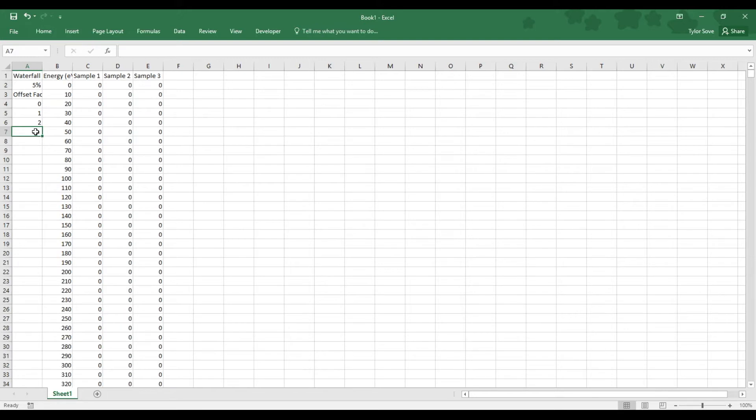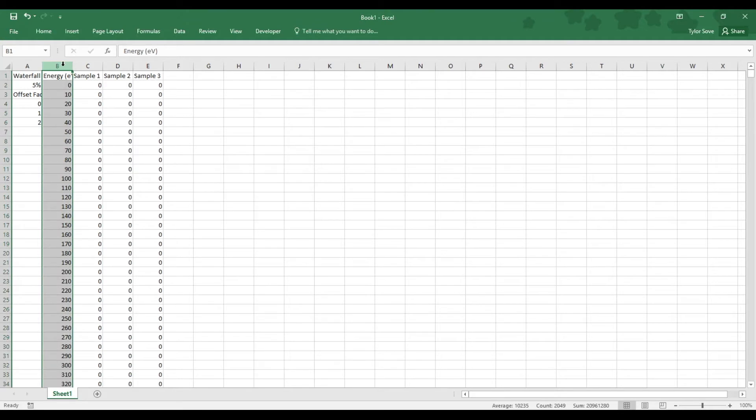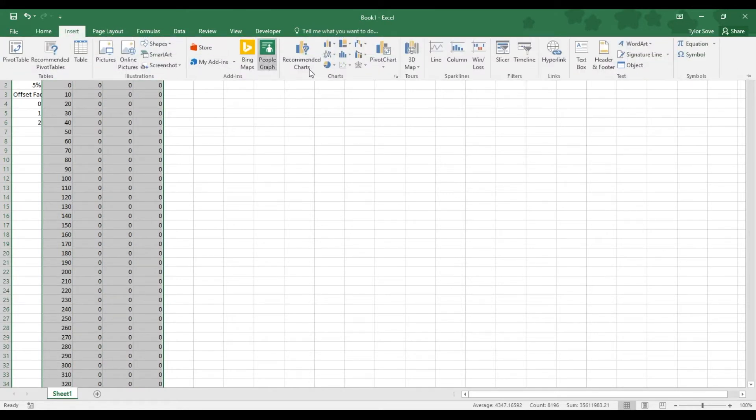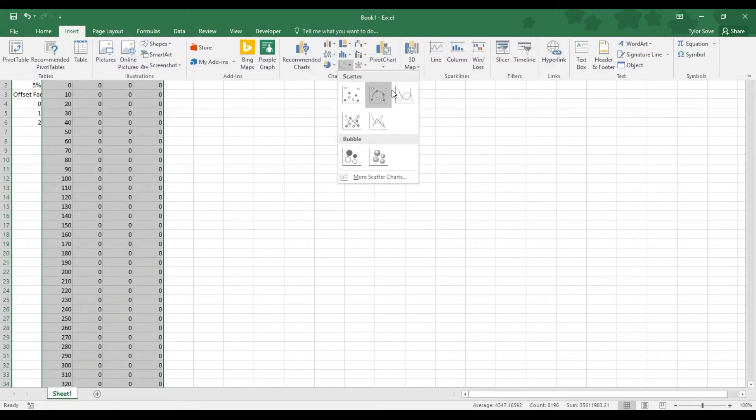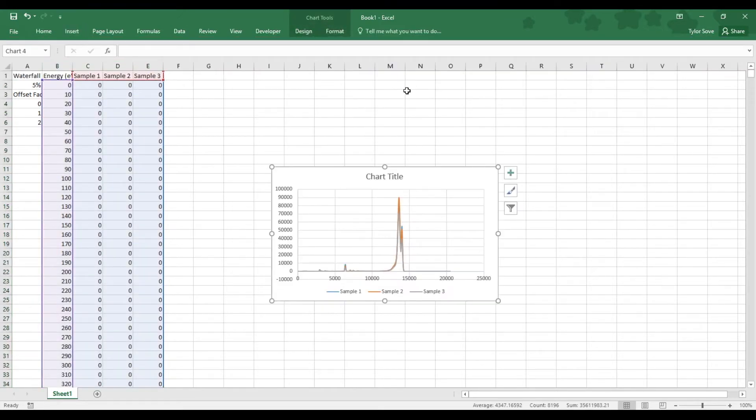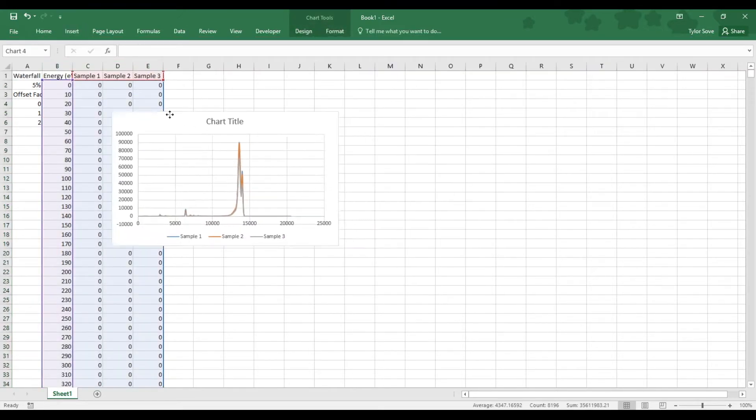To make sure that we do not normalize with the scatter peaks, highlight column header B, hold Shift as you highlight the last column header of your samples, in this case mine is E. Select Insert, go over to the Charts drop-down menu, and select the Insert Scatter with Smooth Lines section there.